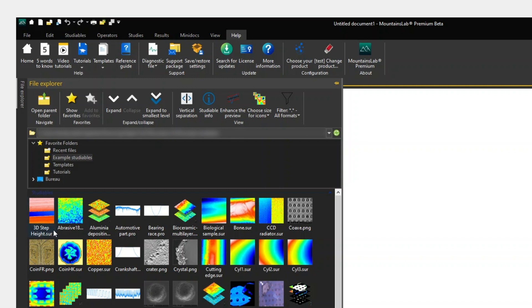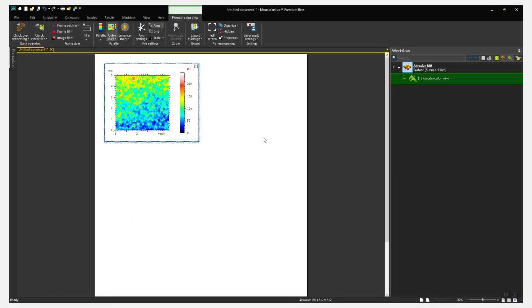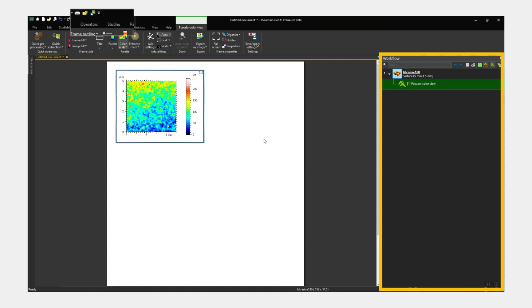To open a studyable, double-click on it. The workflow appears on the right. Operators and studies can be accessed via the contextual ribbon, which appears at the top of the interface.